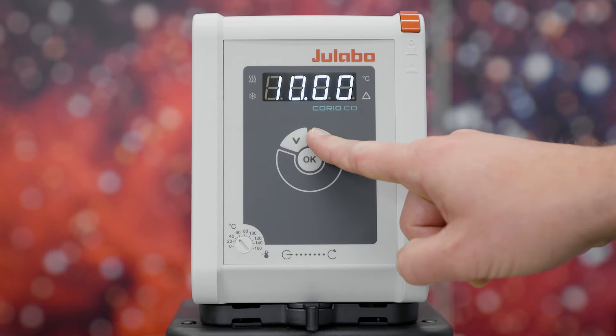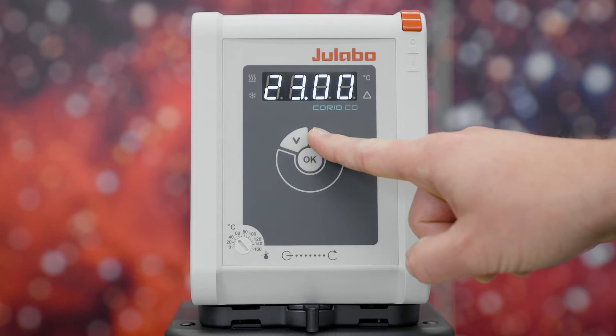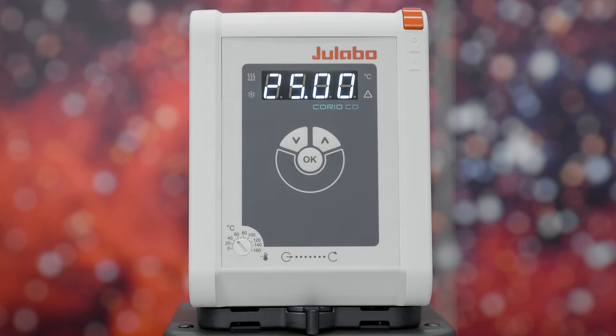You can change this by briefly pressing the arrow keys. First, you can set the integer value. Confirm with OK and set the decimal value as well. To finally set the desired value, press the OK button.